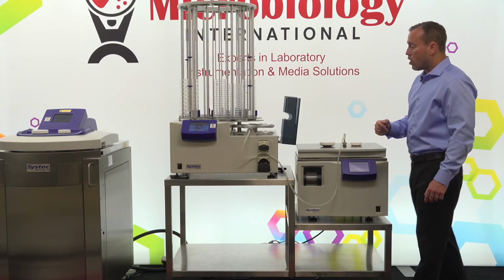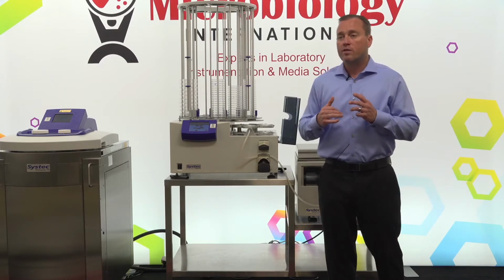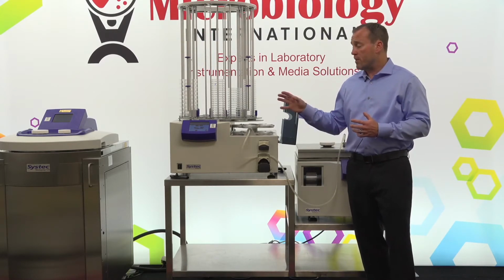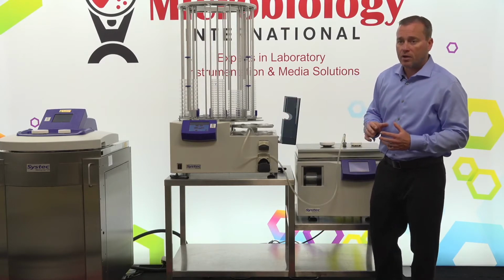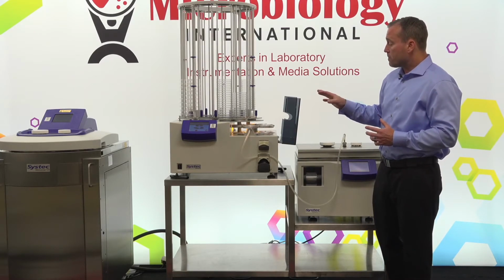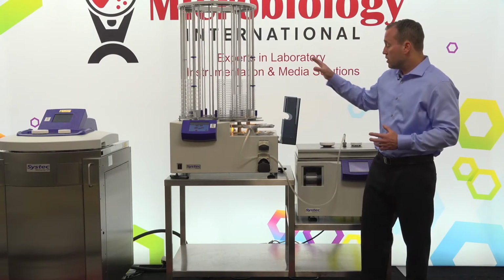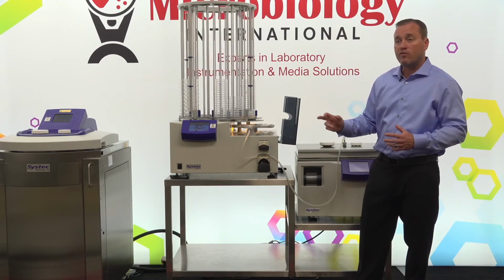Now the system also, for any plate pouring system, if you've operated any of these, one of the most important things about a plate pouring system is to keep it clean. So on the main screen of our system, we do have a cleaning menu that will allow us to go through and clean any of the areas inside of the system. There are no tools required to take any of this apart. The carousel, the lid, and the revolver are all easily removed and accessible for cleaning.